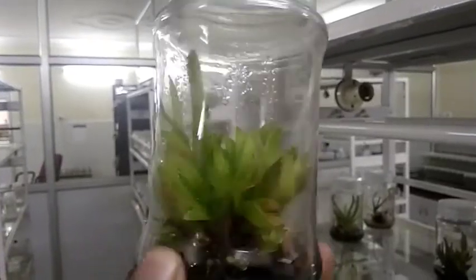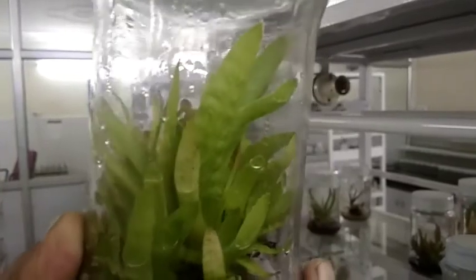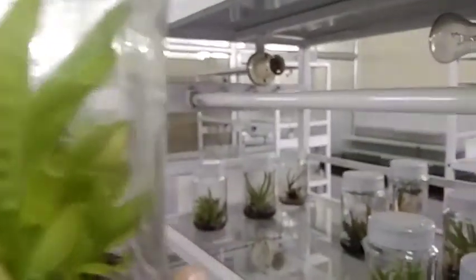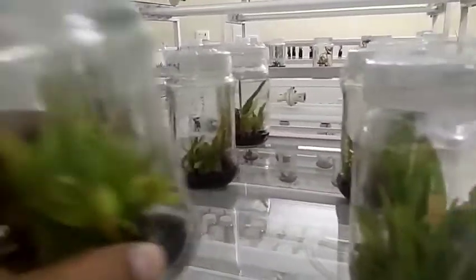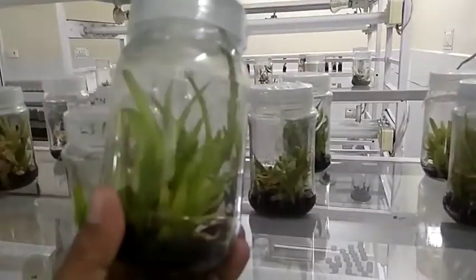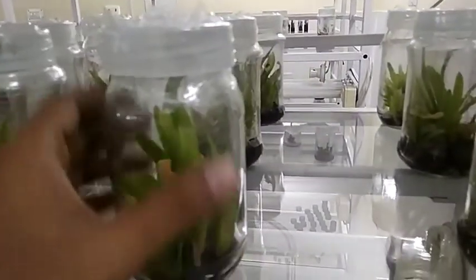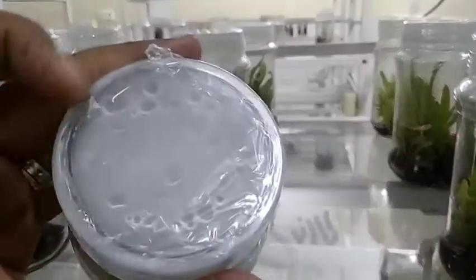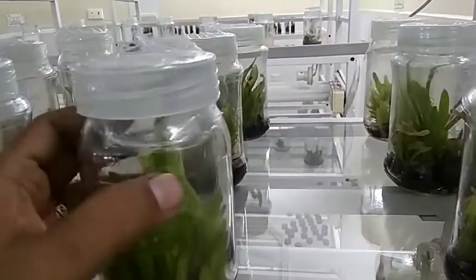Today I am going to show you the tissue culture of aloe vera. You can see the aloe vera plant in a bottle — it is a tissue culture developed aloe vera plant under MS media conditions. They are grown in a bottle covered by a polythene sheet; it is airtight so that infection may not take place.